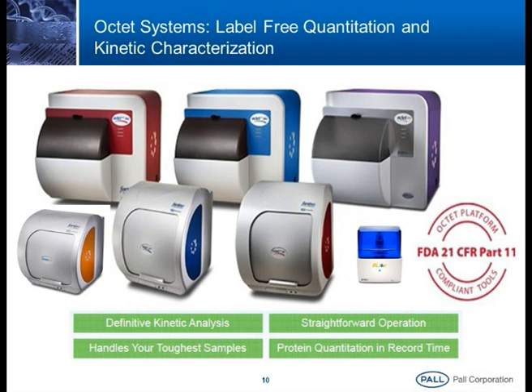Okay. This is an 8 channel instrument, which I brought here. At a time you can run 8 samples. You can finish the kinetics or the quantitation studies. Suppose for quantitation you are expressing proteins and have a question about their concentration. With this 8 channel instrument we can measure 8 samples at a time. We can perform different dilutions in the kinetics, higher to lower dilutions, and conduct kinetic studies here.